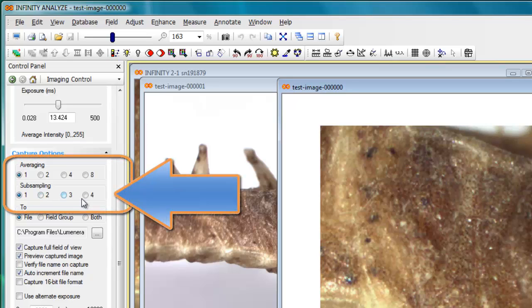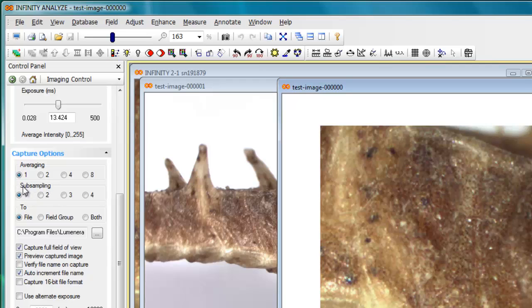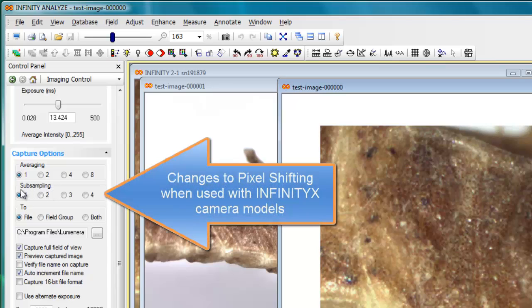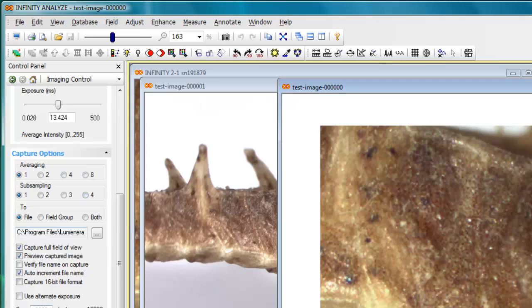Subsampling is available on many of the CMOS cameras. You can do subsampling by 1, 2, 3, or 4. And if you're using an Infinity X32 camera or the older X21 camera, the software will detect that and this box will change to pixel shifting. So this will be where you would select whether or not you're collecting a single resolution image from the chip, or if you're using pixel shifting 2 times in X and Y, 3 times in X and Y, or 4 times in the X and Y direction. So that covers most of the options available, most of the camera settings and application settings for the capture options panel.